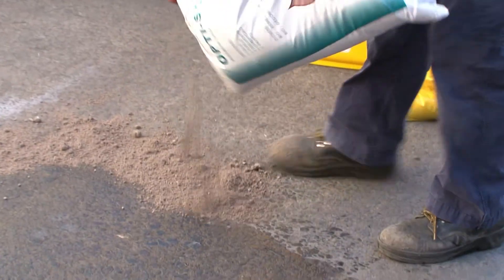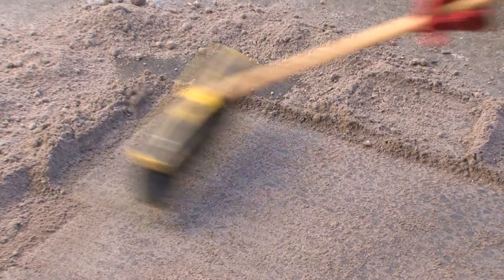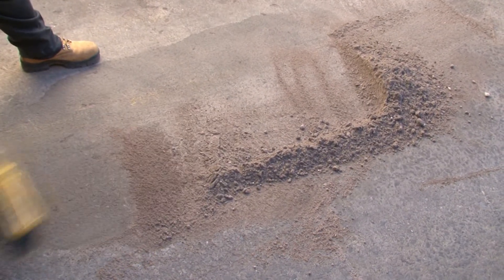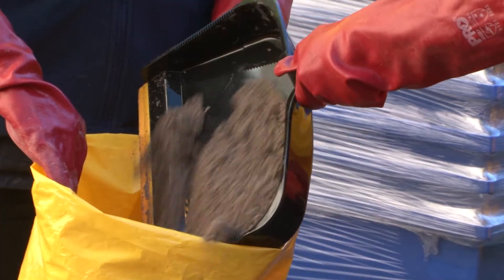Using enough Optisorb 40 to cover the area of the spill, create a mound around the perimeter of the spill and then sweep towards the centre using a broom. Sweep the Optisorb 40 back and forth over the entire area of the spill, then sweep into a pile. Collect the used Optisorb 40 and place in the approved waste disposal bag.